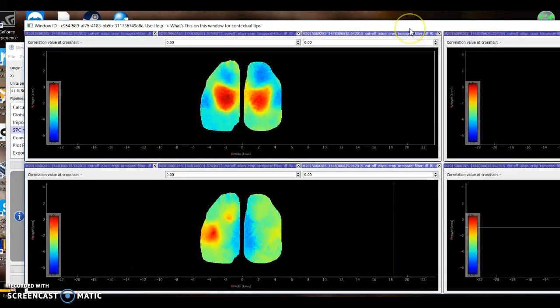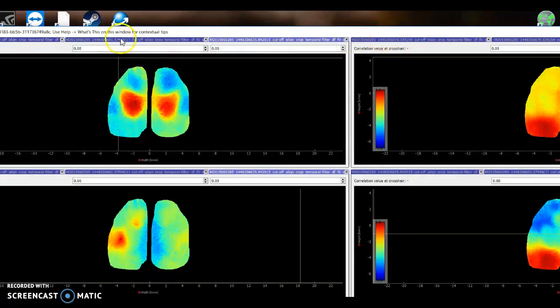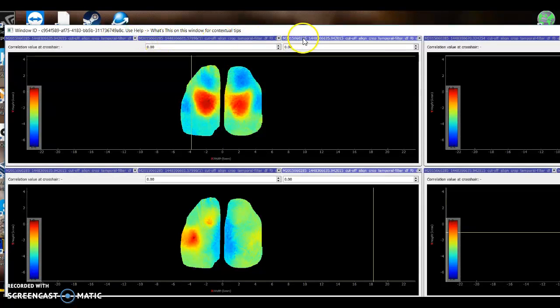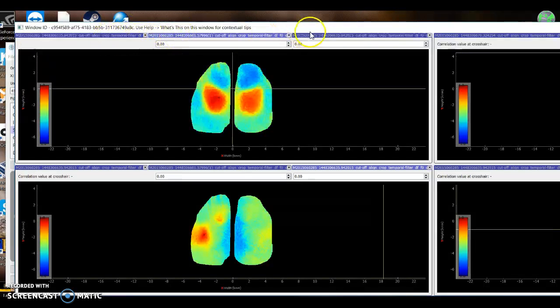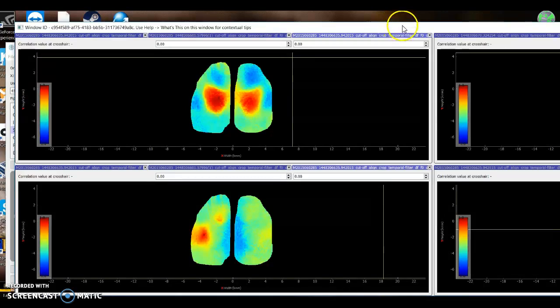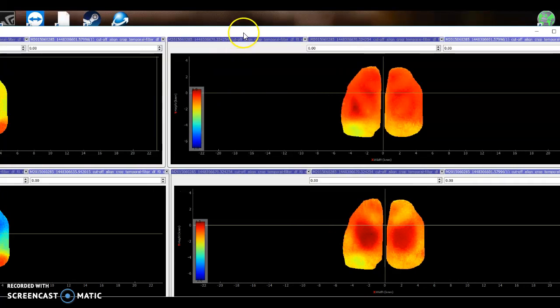So in hindsight, I obviously did this the wrong way around. Each doc right now is a single ROI, and then the tabs are going across different image stacks. You'll see that there's only 3 because the other one was just too ridiculous, so I redid it. What I should have is the ROIs at the top here as tabs, and each one of these as a single image stack. And each one of these has a range that you can see here.